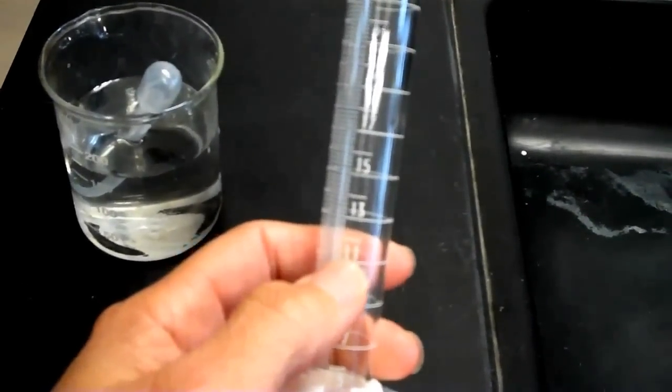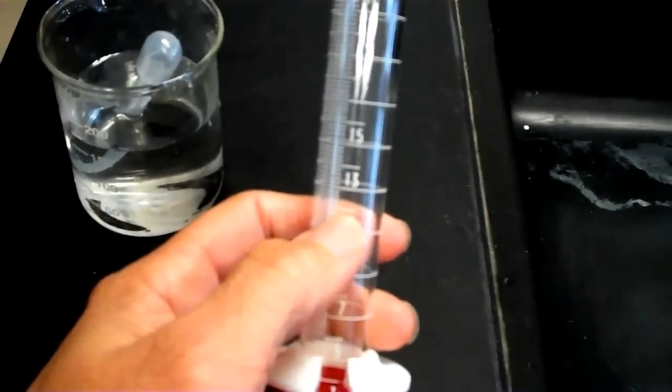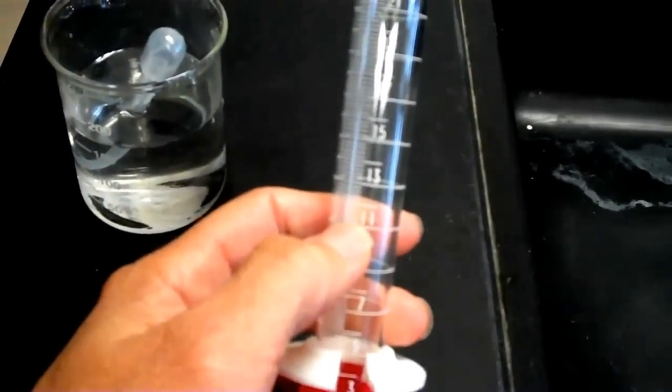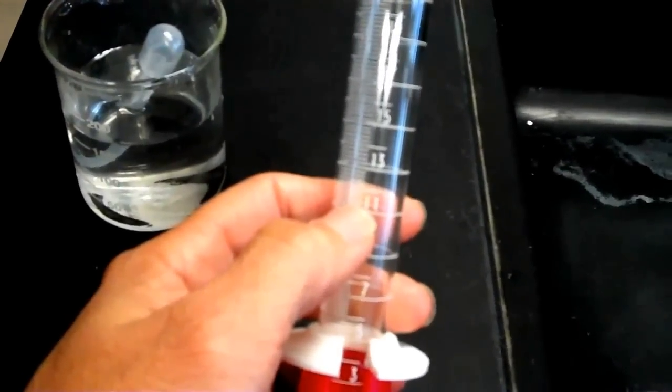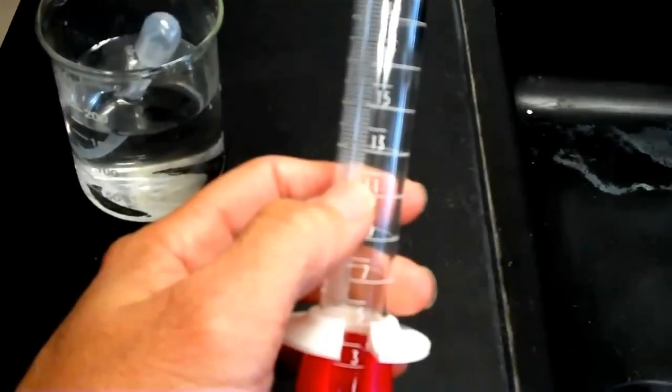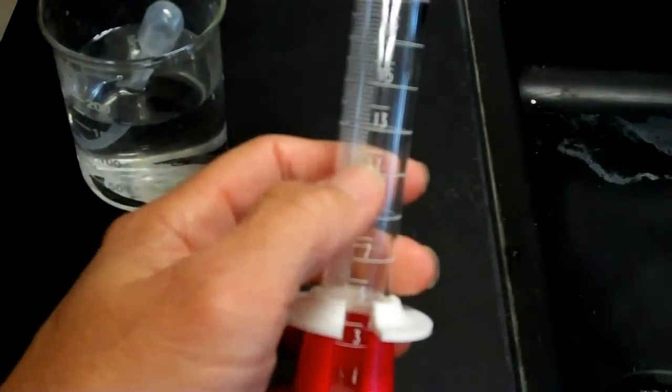On this one, it goes from 11 to 13, and in between that is 12. And so these smaller marks represent, this is 11.2, 11.4, 11.6, 11.8, and then 12, okay.